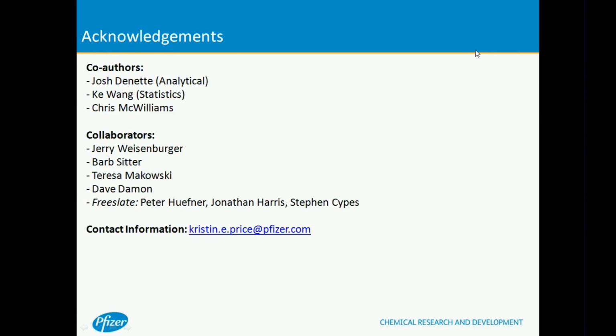Thank you. The next question that has come in is, do you use metal hoppers or plastic hoppers? We have both metal hoppers and plastic hoppers. In my limited experience with solid dosing on the system, I would say I've had far better results with the metal hoppers, primarily because we had problems with static and material sticking on the plastic.